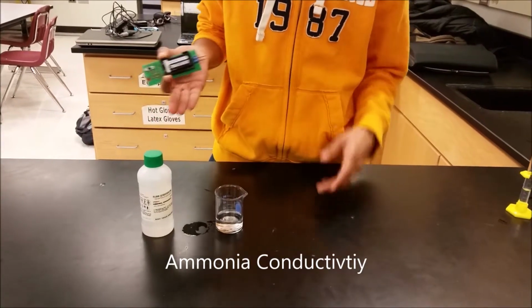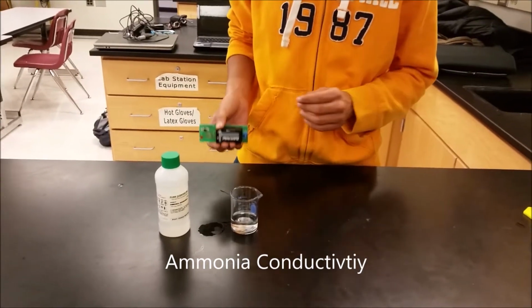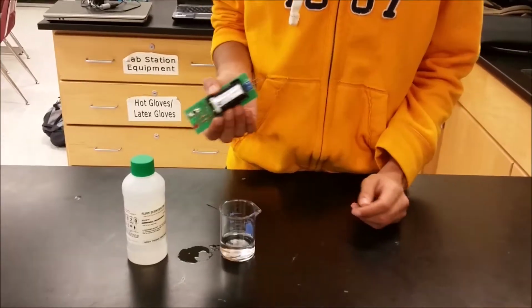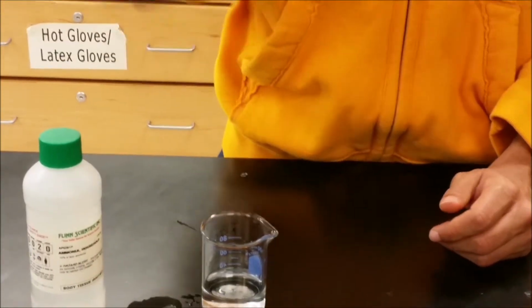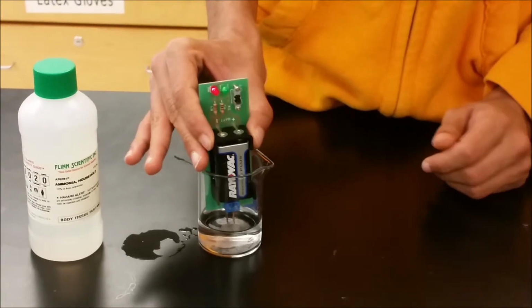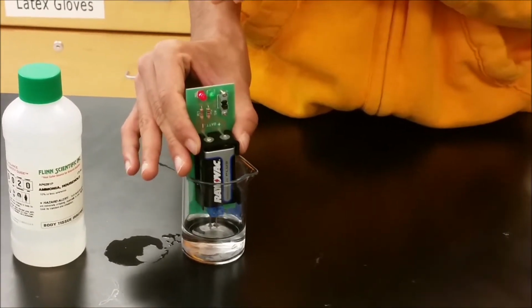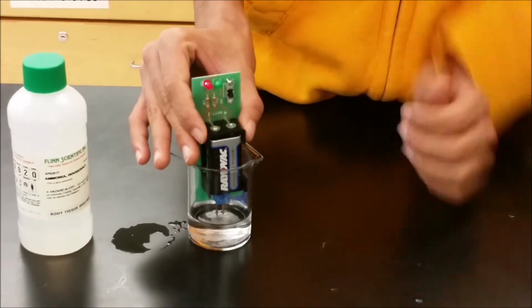This time we have ammonia, and we again have a 0.1 molar concentration of it inside of this beaker. We're again going to test it for conductivity with this probe. Unlike the last two times, this time the red is only dimly lit, and the green isn't lit at all.